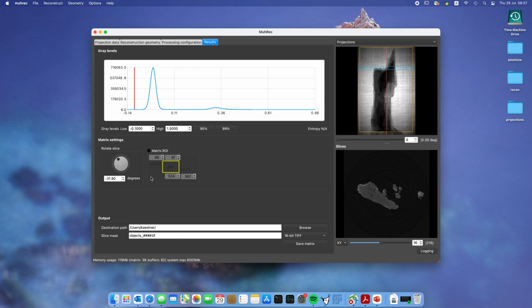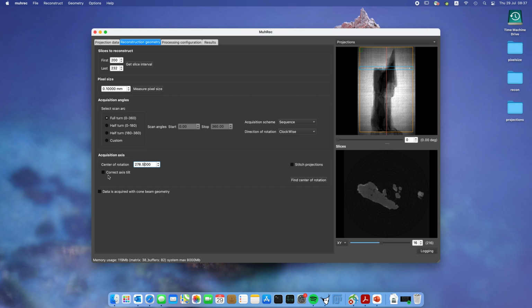Now, as you see here, I didn't have any axis tilt correction yet. If we now do this reconstruction down at something like, let's say 700. Now we should save this geometry store. So let's go down to 700. Oops. And 732.